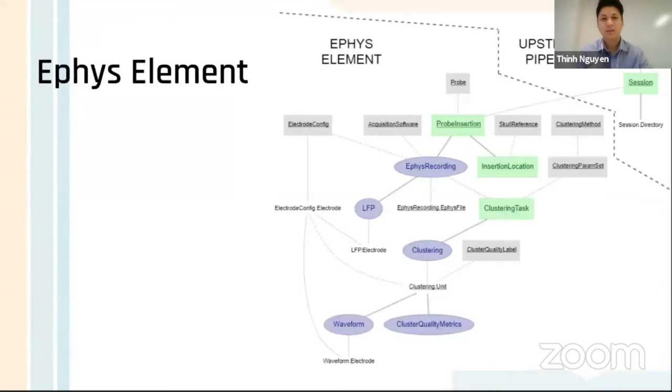All right. Okay, the next one is another example of another element. This is the Array Ephys element, the element array ephys. And as you see, it's just this component right here. There's also an upstream component where the Ephys element is being connected to, right? As you can see, all of these are DataJoint schemas and tables, fully defined for an extracellular electrophysiology type of experiment.